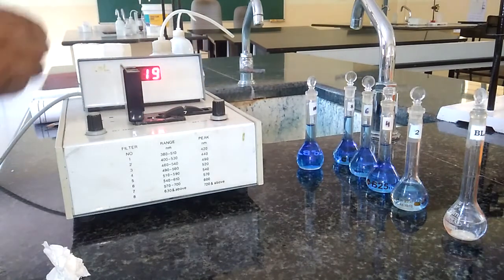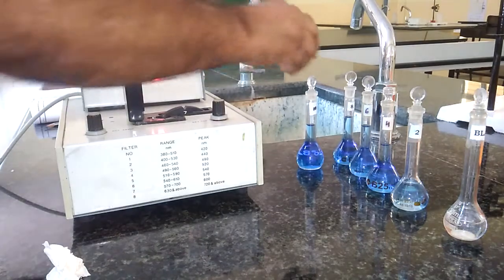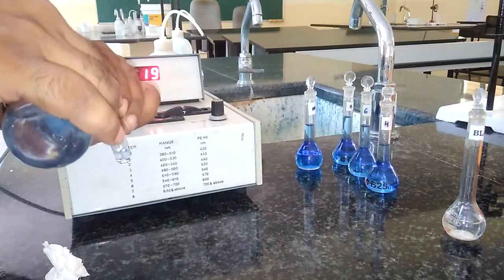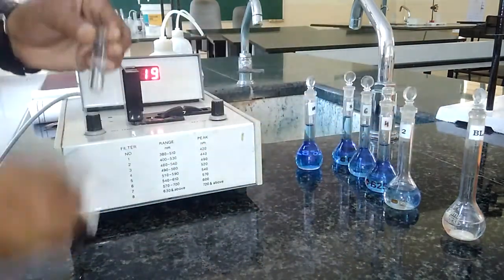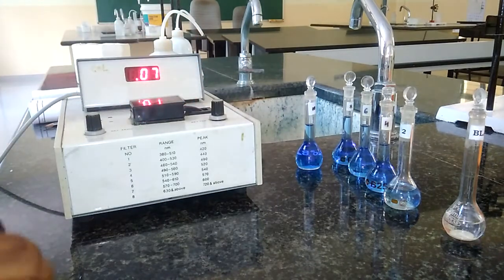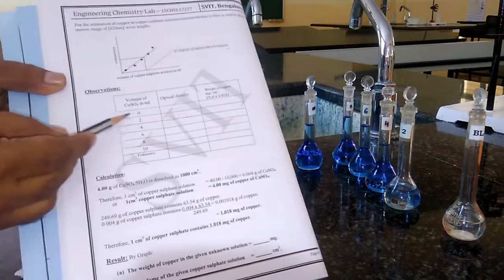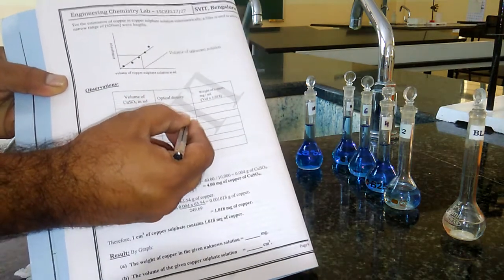After setting the optical density to 0, we discard the blank solution and wash with distilled water. Then we measure the absorbance at the same wavelength for all the remaining colored solutions, starting from 2 ml. I am adding the 2 ml copper sulfate solution. Before adding, we rinse the cuvette with the same 2 ml solution, then fill three-fourths. Wipe well to remove any moisture content. It is giving 0.07 — so 0.07 is the absorbance for the 2 ml copper sulfate standard.